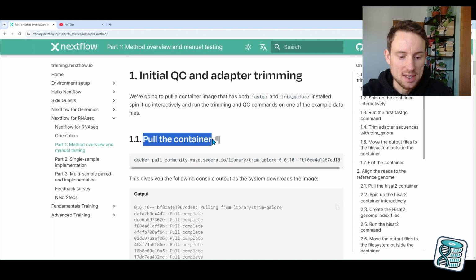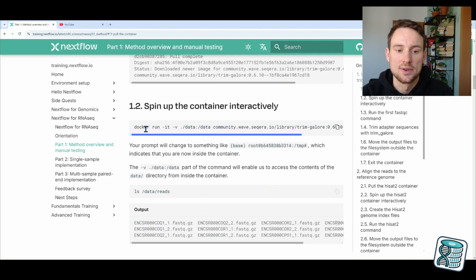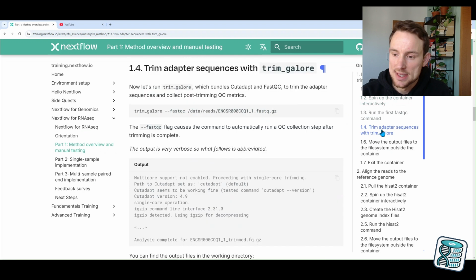We see that what is done here is they use containers that contain the dependencies and definition of the tools. And then using Docker, you can start a container, and in this Docker container, you can then execute the individual bioinformatics tools. So for instance, here, FastQC has been run in a Docker container. There are different steps here. As I said in the beginning, we have a FastQC step. The next one would be a Trim Galore step, which is clipping off the sequencing adapters.